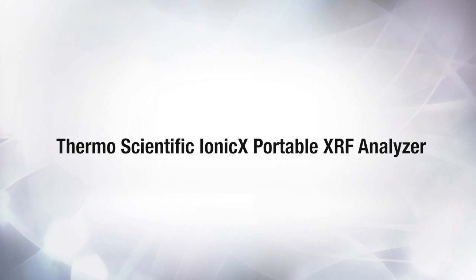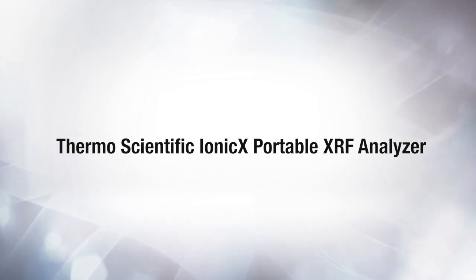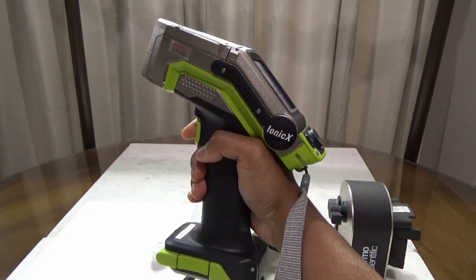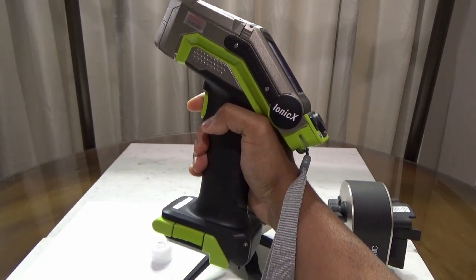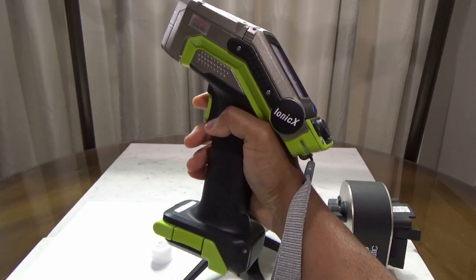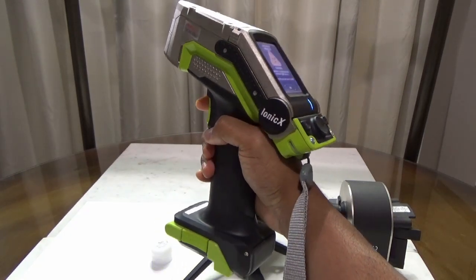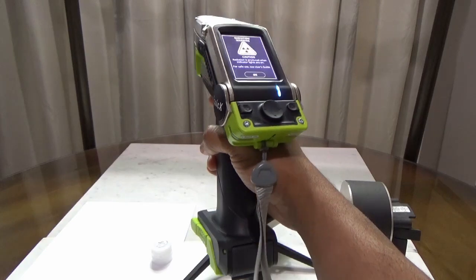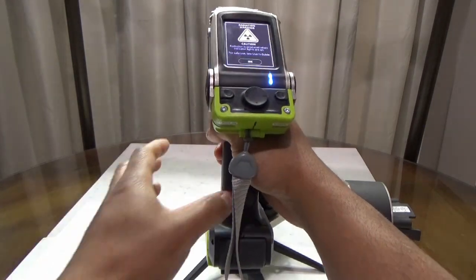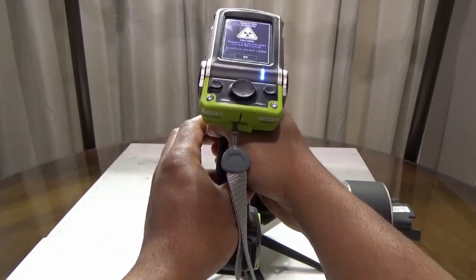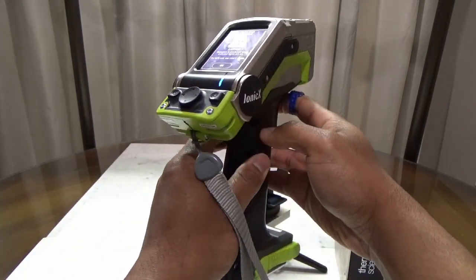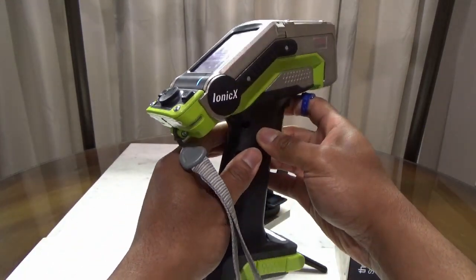In this video, I'll show the functionality of the ThermoScientific IONIC-X Portable XRF Analyzer. IONIC-X is a very small portable XRF analyzer that is purpose-built to identify a variety of ionic salt raw materials, such as sodium chloride, potassium chloride, and calcium chloride.